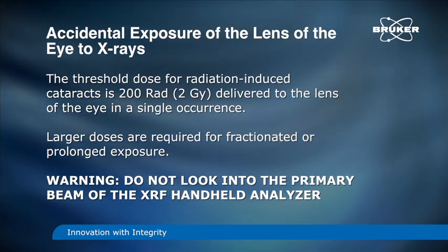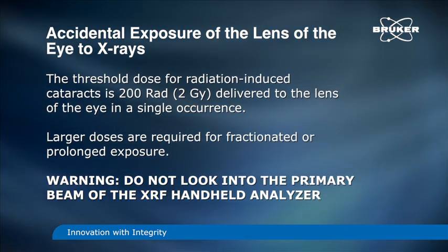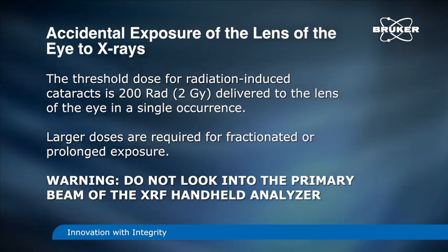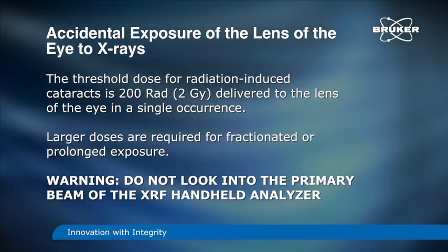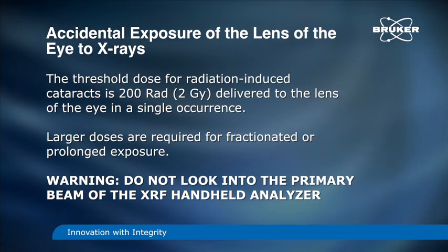Warning: do not look into the primary beam of the XRF handheld analyzer. If the unit is used in accordance with manufacturer's instructions, acute radiation effects will not occur.